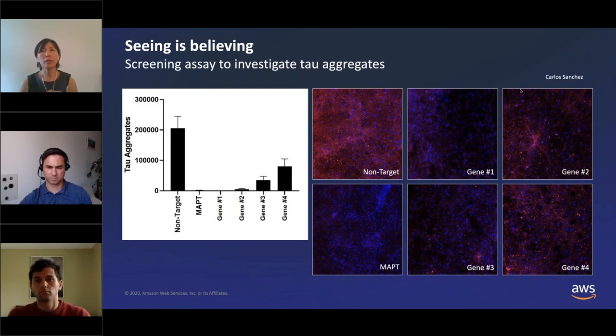So the segmentation-based quantification is very effective. With ACS-IA, this process can be highly scalable and also very reliable. And the ACS tiles complement that with efficient image review. These experiments involve using reagents directly from Alzheimer's disease patients, so being able to see all the images is especially valuable for this experiment. So next slide, please.